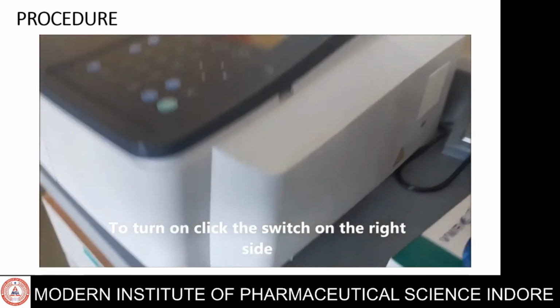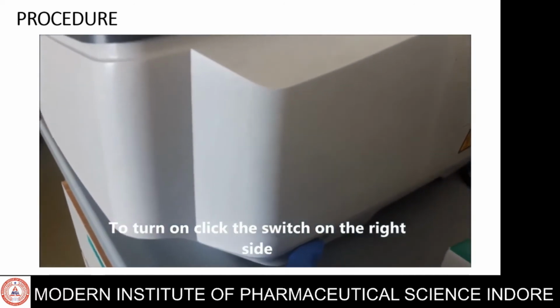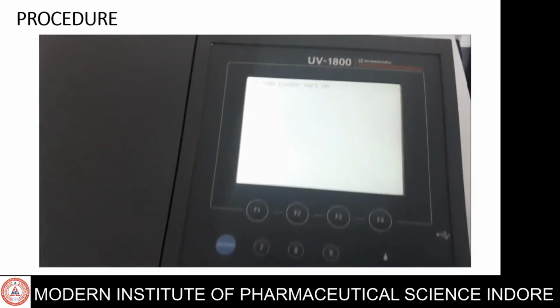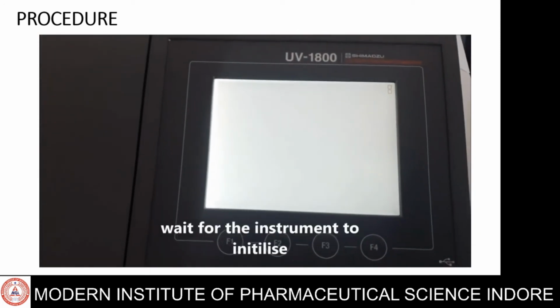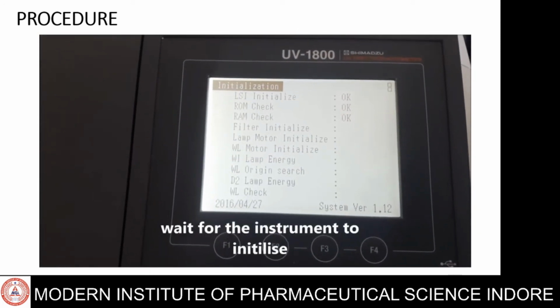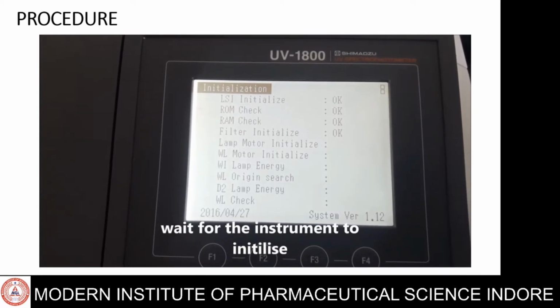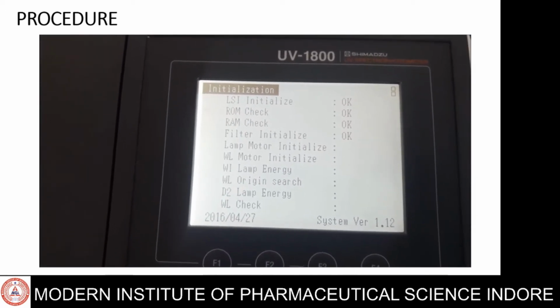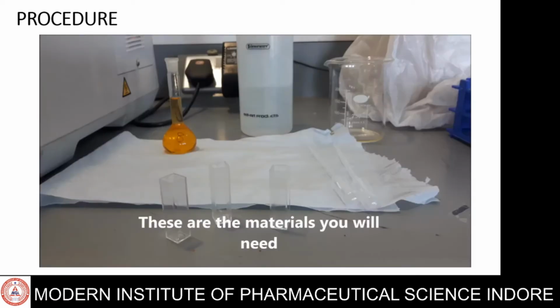First, to turn on, click the switch on the right side. First, we have to switch on. Wait for the instrument to initialize. We have to do baseline correction using the solvent which is used for taking absorbance of any drug.